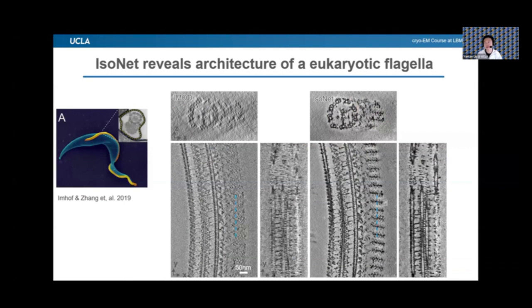So from the virus we go to the organelle, to test our software. This is the flagella from the organism called Trypanosoma brucei. This is the structure of the axoneme. The axoneme has a microtubule doublet, and also the dynein, and also the radial spoke.